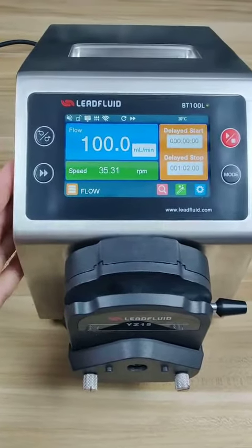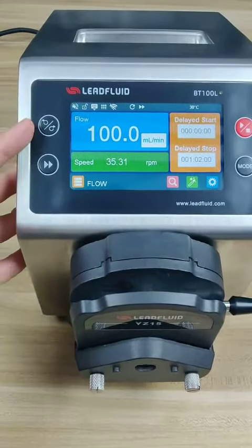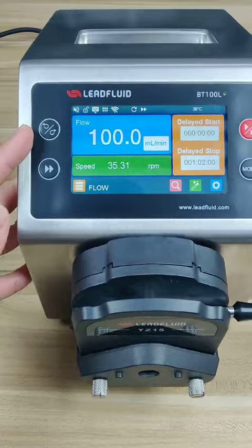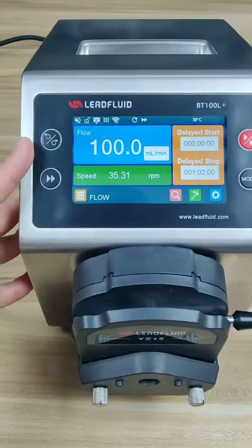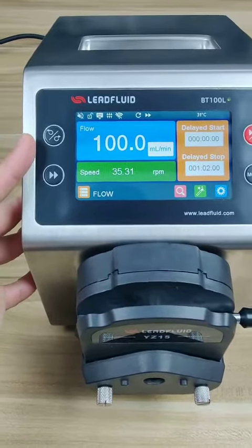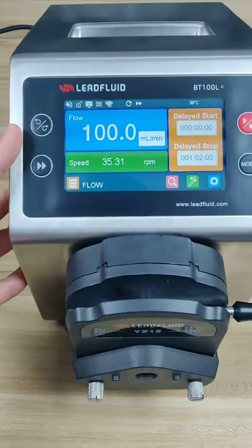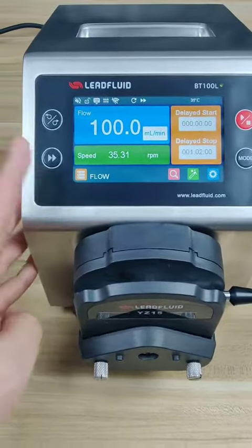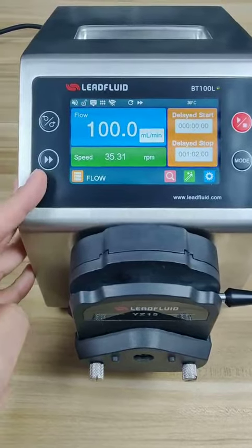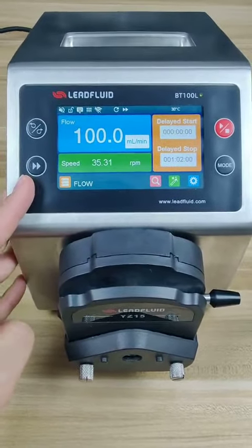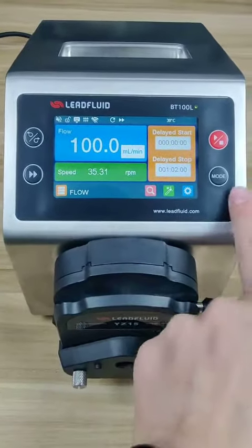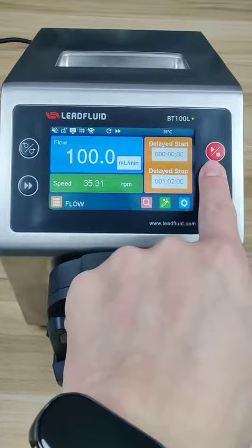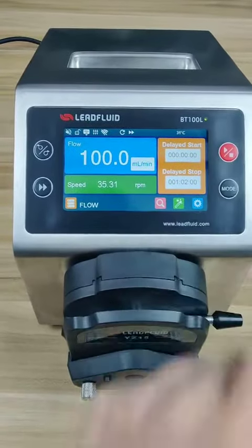Here are four keys. This one is the direction key — this pump can do clockwise rotation and counterclockwise rotation. This is the full speed key. This one is the mode key. And this one is the start and stop.